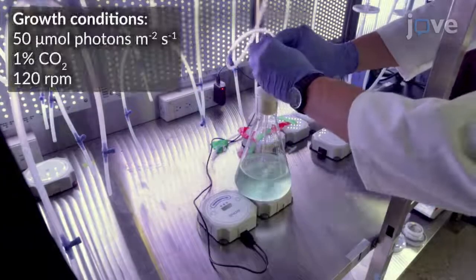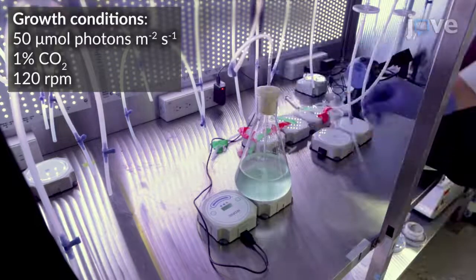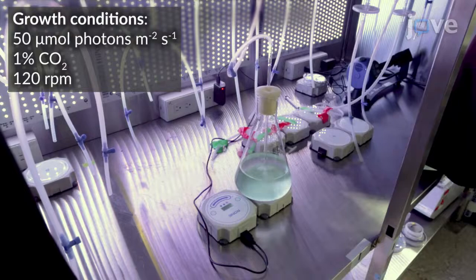Grow the culture with constant stirring at 30 degrees Celsius until the OD reaches 0.8 to 1, indicating a late exponential growth phase.